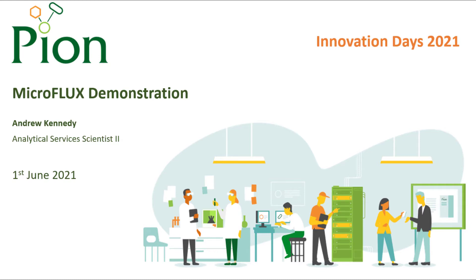Hello, and welcome to a short demonstration of Pion flux technologies. During this session, I will introduce the various hardware and accessories used to run flux assays, and demonstrate how to assemble the constituent parts and run an experiment. Finally, we'll take a brief look at the data we might expect to obtain from these tests.